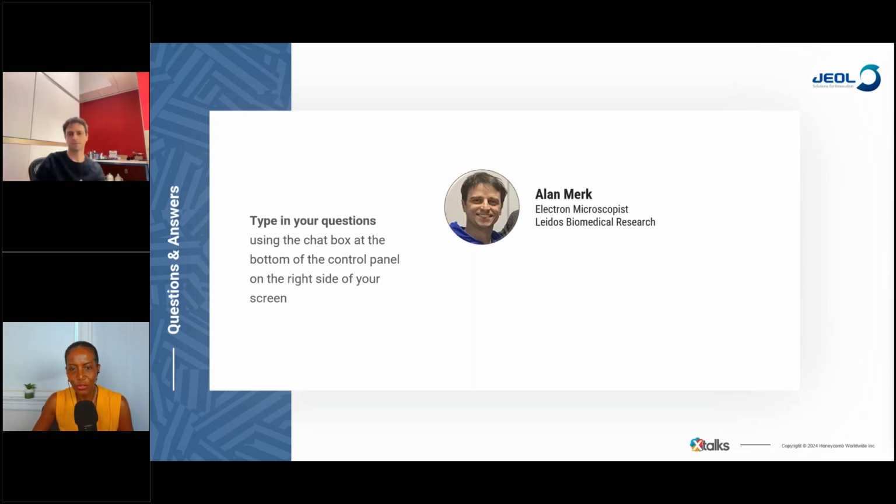I'm going to squeeze another question in here. How do you transform the microscope data to generate these animations? Do you have a specific software recommendation? For the animations, for these ones, I actually used old Chimera. I know that people like ChimeraX, especially for visualization things, but for myself, I'm old and I'm used to regular Chimera.